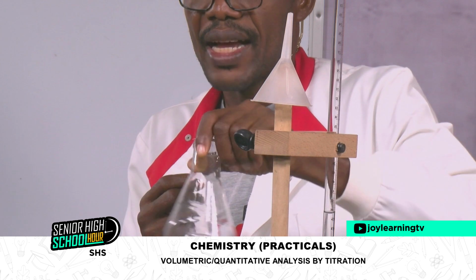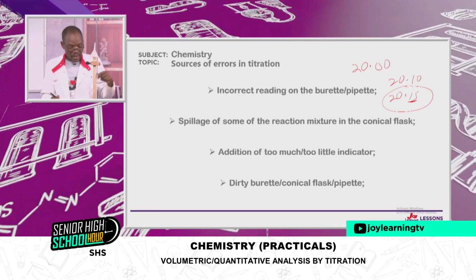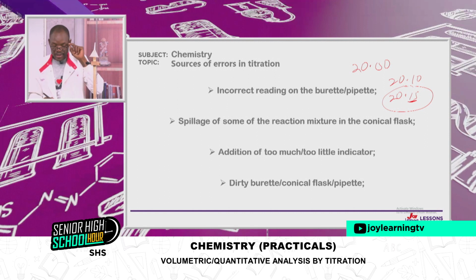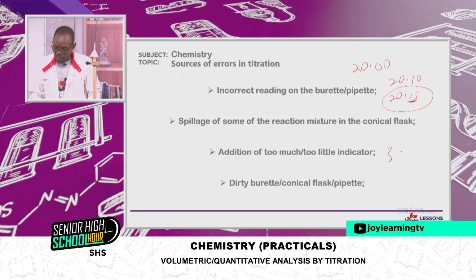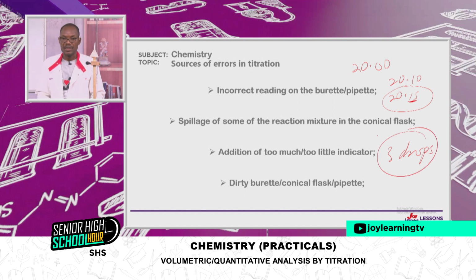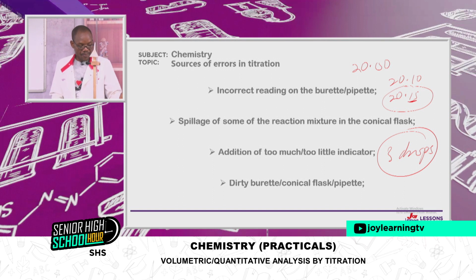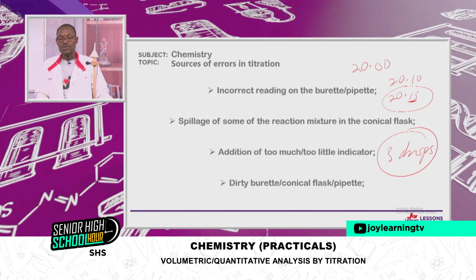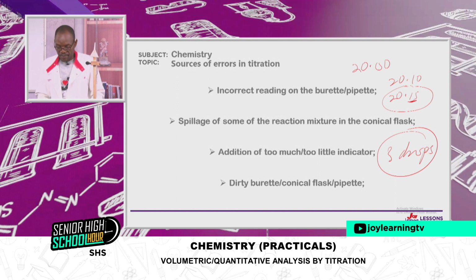swirling like that. Addition of too much or too little indicator can also affect our process. So here we will talk about 3 drops of the indicator in the process. So whenever I pipette my solution into the conical flask, I use 3 indicators. Or sometimes you'll be asked to use 2 drops of the indicator, and that will be fine.